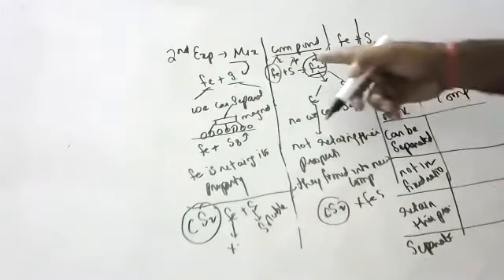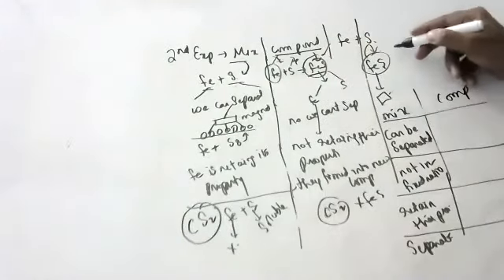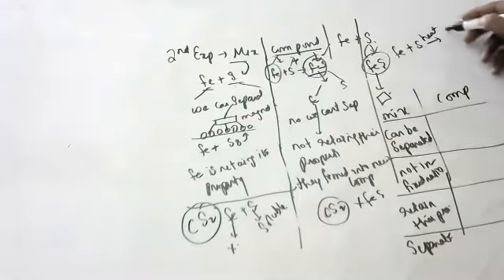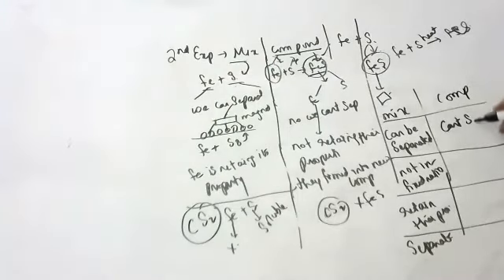Here, in the compound iron sulfide, once you take the iron and sulfur mixture and heat it, you get iron sulfide. In iron sulfide, you can't separate iron and sulfur, children. And they are in a fixed ratio. In iron sulfide, they are in a 1:1 ratio.